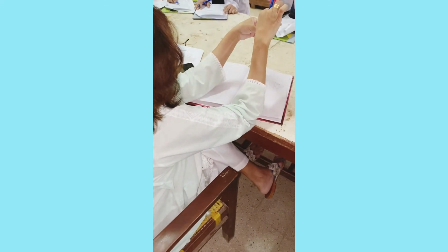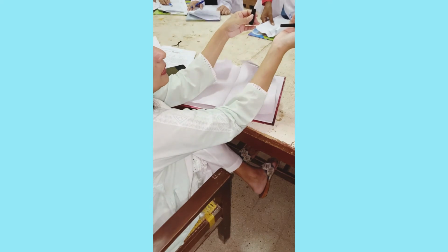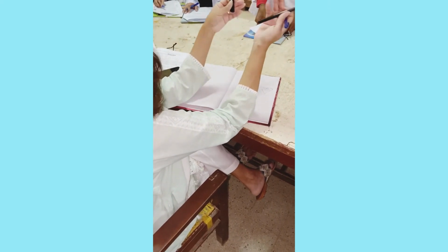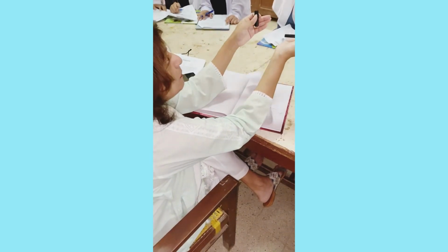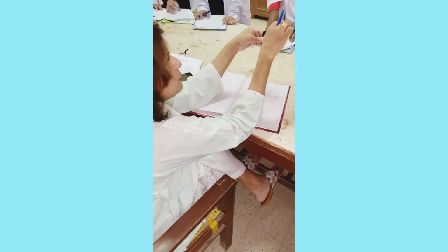You have to wash it with distilled water. What is happening when you are washing? Tell me what is happening. The 20% product will go away. The 20% product, the ortho product, will be removed, and what else will be removed? The impurities. Some of the impurities will be removed when you wash.